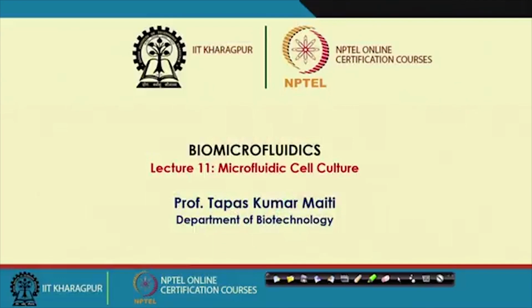So, in this lecture I shall go through how microfluidic systems are used for cell culture and how they differ from the traditional cell culture systems used for 2-dimensional and 3-dimensional cell culture. Furthermore, we will also go through the main challenges that microfluidic systems face in understanding the fundamentals of biology, as well as the application aspects of biological systems, particularly healthcare related systems.